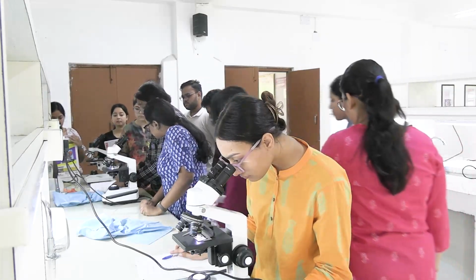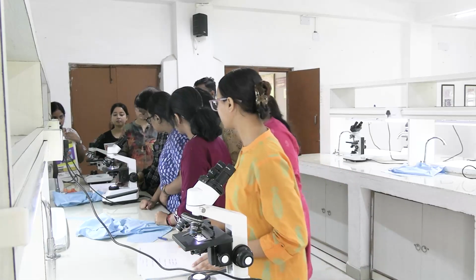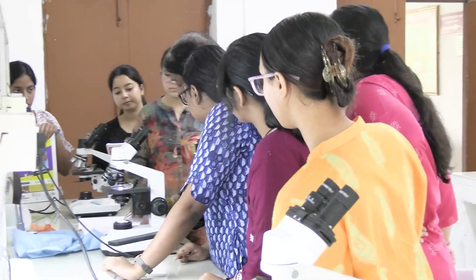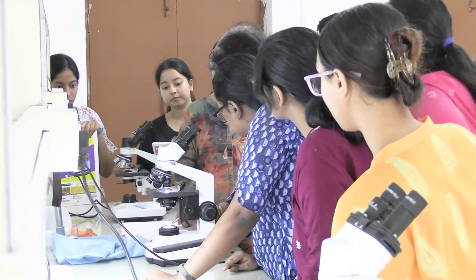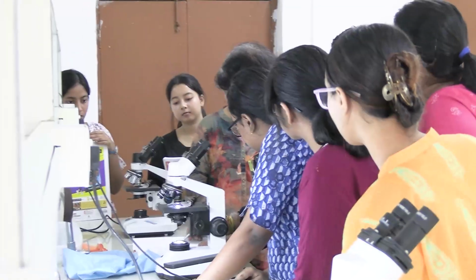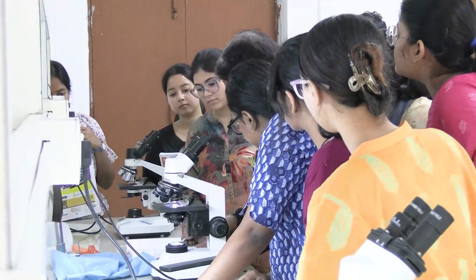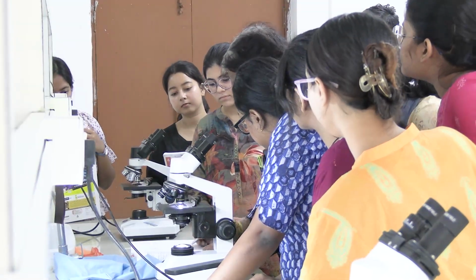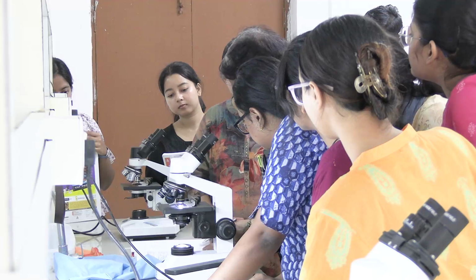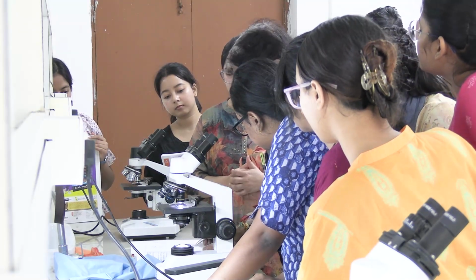Now two lymph nodes I'm just saying. Now what see this? Now lymph node you can see like this. These are all connective tissue. You can see the blood vessels. This is the medullary sinus. Now you label, okay.